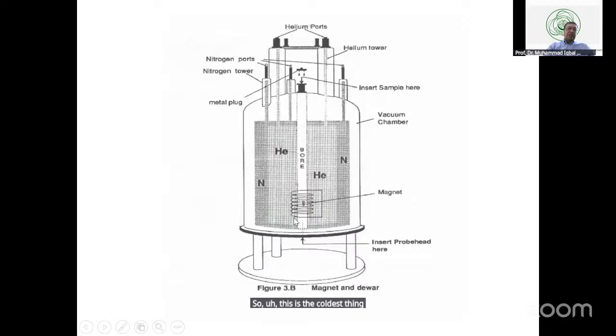If you place this magnet in liquid helium and give this magnet electricity only for a few seconds, these electrons moving in this cable remain there. Conductance is close to 100% and resistance is close to 0%.